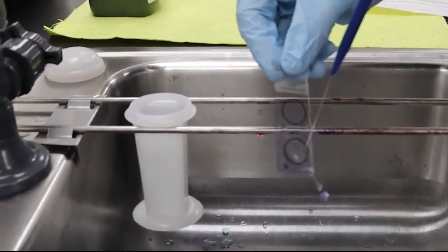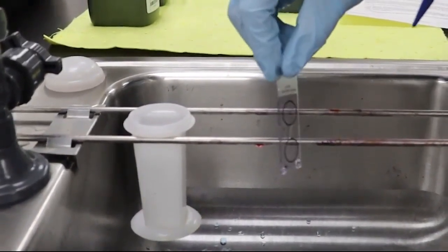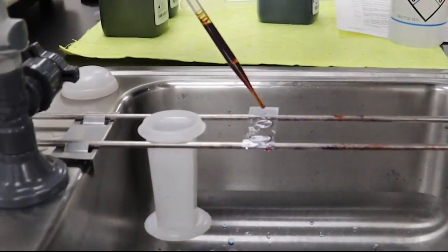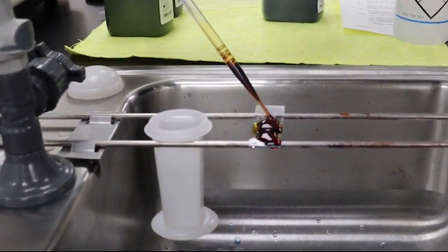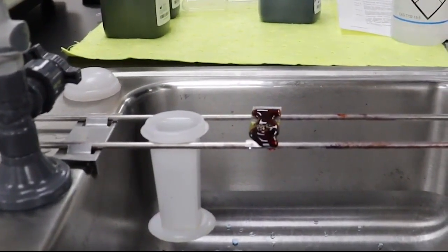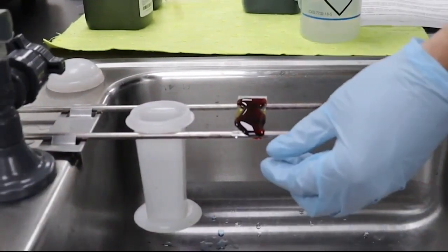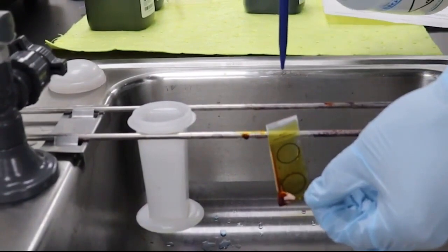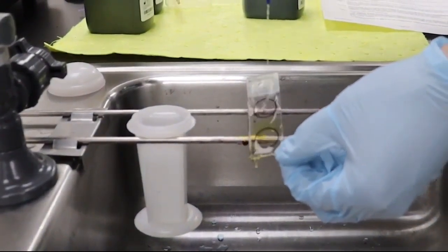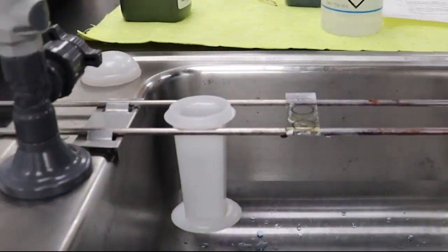Excessive rinsing, as shown here, may impact the final stain. Our documented procedure suggests rinsing briefly for no more than 5 seconds. We're then going to apply our iodine solution to the slide for 45 to 60 seconds, again making sure to flood the slide with enough solution to fully cover the specimen. When possible, avoid using a spray bottle as seen in this video because an intense stream of water might loosen the sample and cause it to fall off the slide. We suggest running the slide in gently running tap water instead.